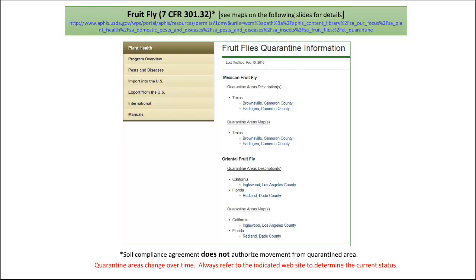This particular quarantine comes and goes. Sometimes they'll take the quarantines off, and sometimes they'll add new ones. So these are considerations, and in the document Sample Submission Protocol for the Kellogg Soil Survey Laboratory, I believe on part 1, there's a page in there that tells us exactly what areas of the world and the country that you cannot sample from or send samples in without first checking with us.